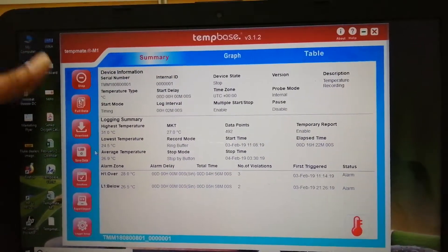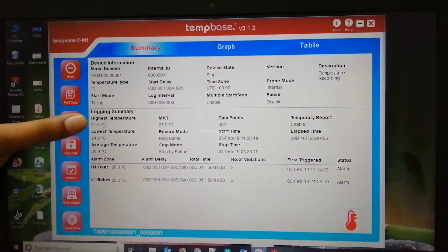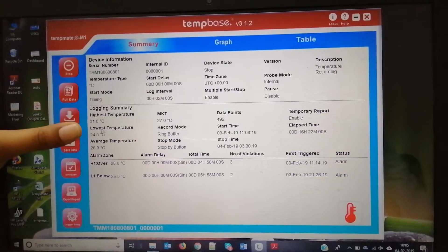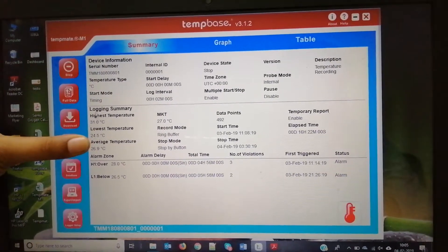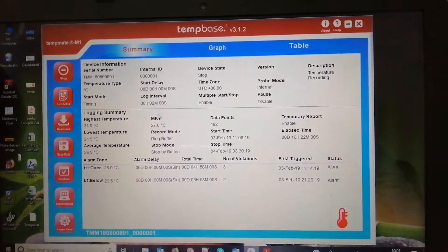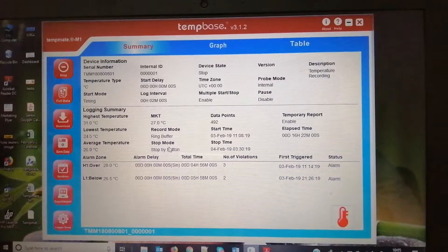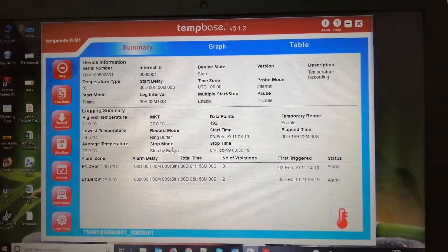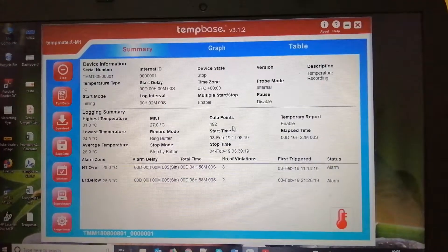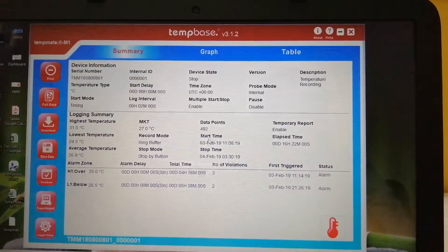Here you can see the logging summary, which shows the highest temperature recorded — also shown on the display — and the same is shown in the software. It also shows the lowest temperature, average temperature of all recordings, the mean kinetic temperature value, and you can stop the recordings by two ways: one with the software and one manually with the keys. The data points are 492.